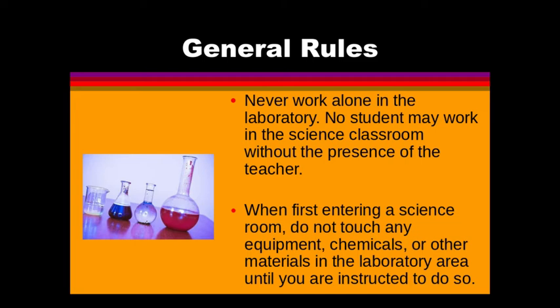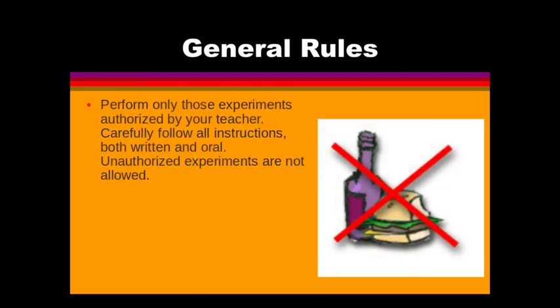Don't touch the lab materials. Usually I have to set everything up in between the class exchange, so when you walk in the class, your labs are ready to go, but that doesn't mean it's ready for you to start. When first entering a science room, don't touch any of the equipment or the chemicals or the materials until you're instructed to do so. Okay?